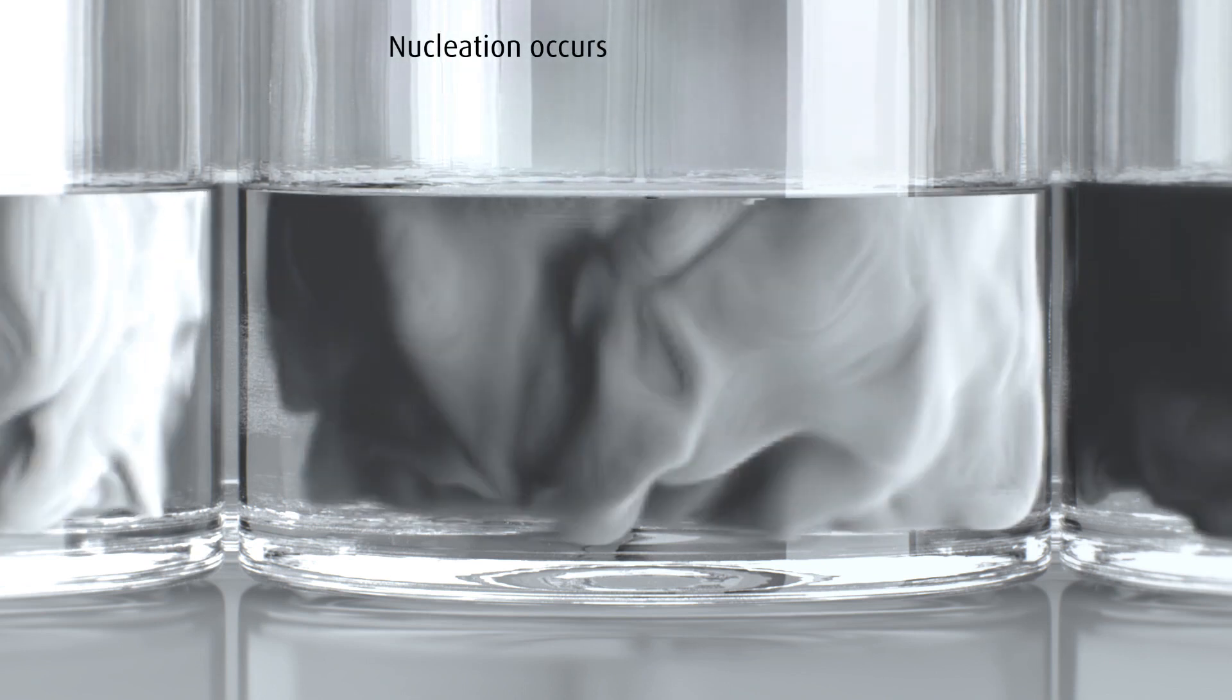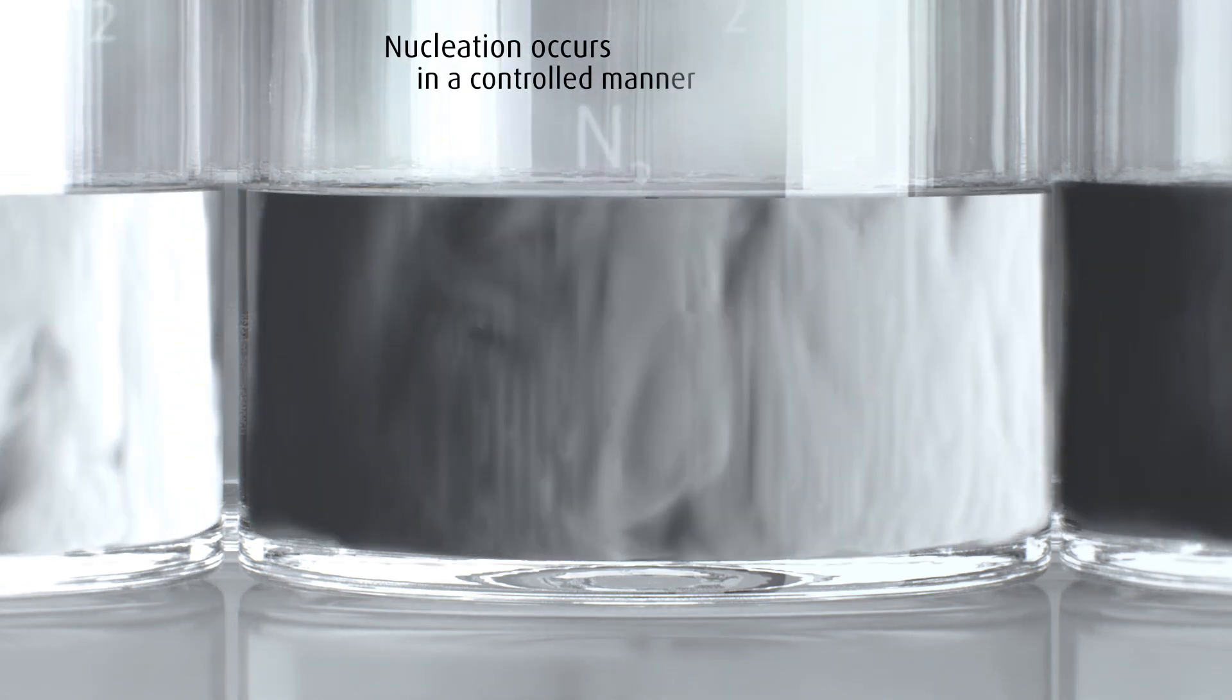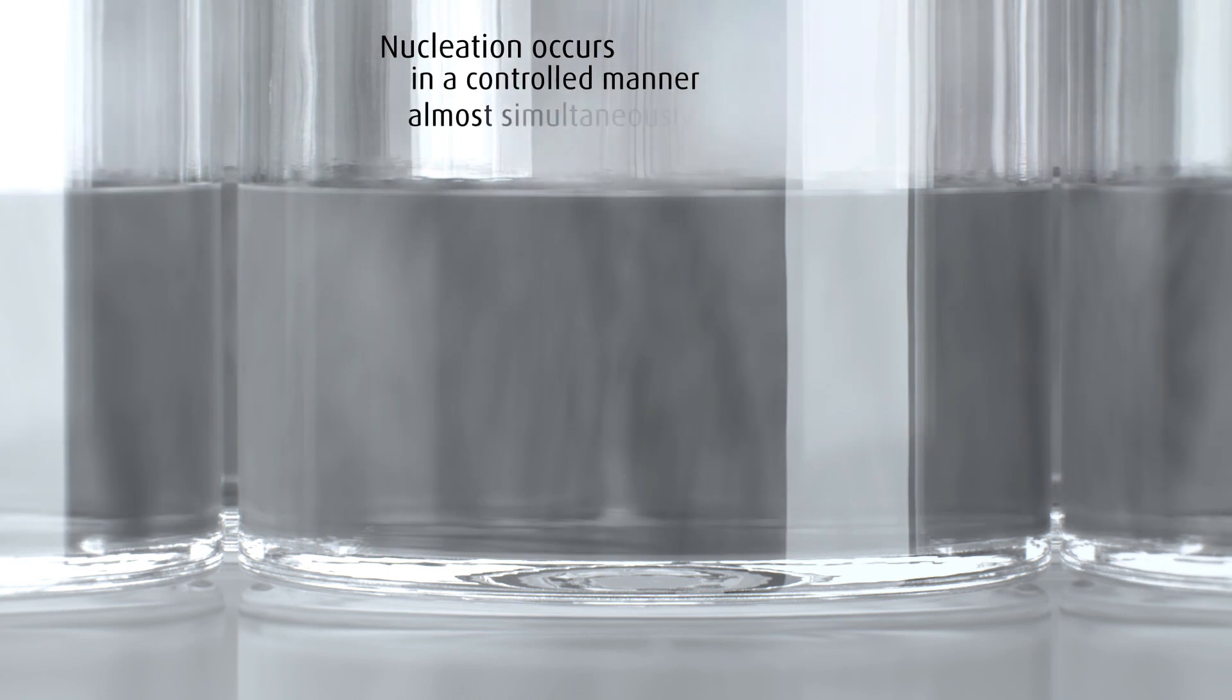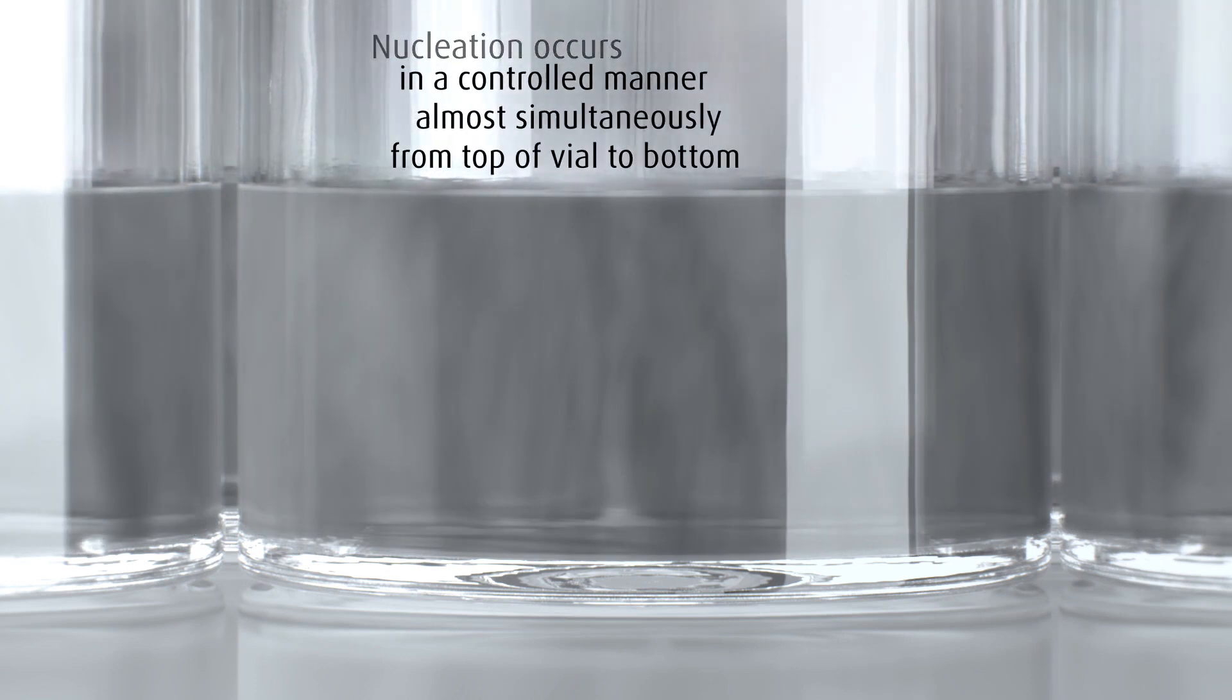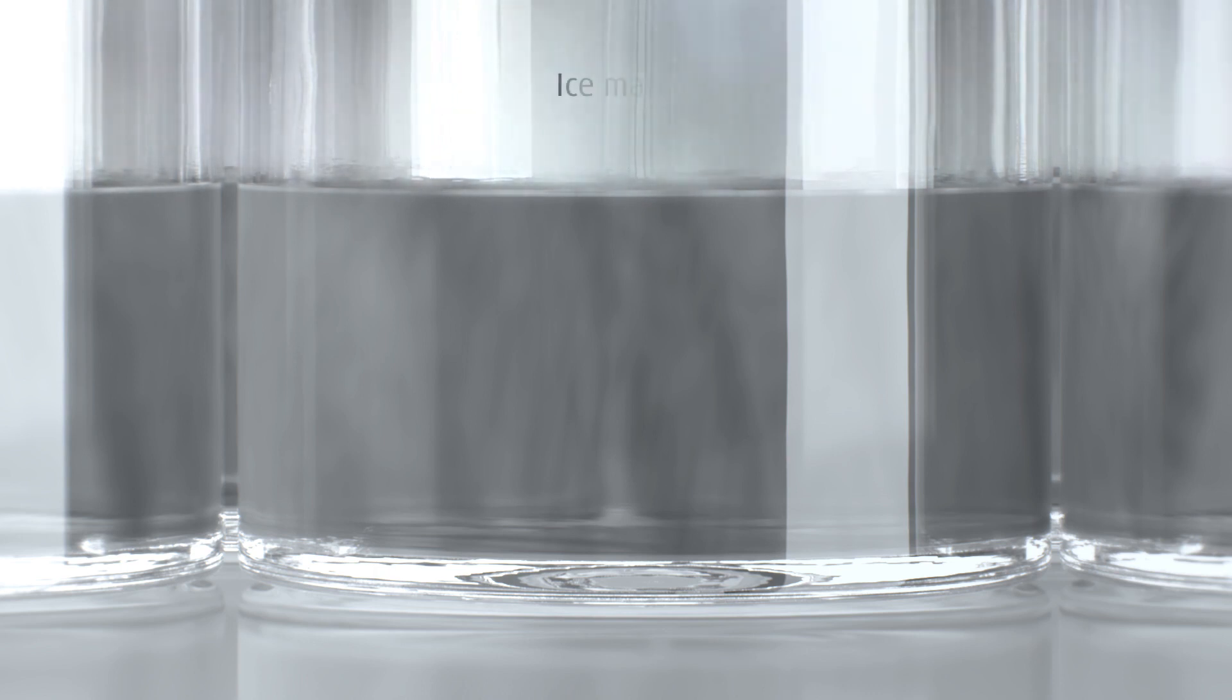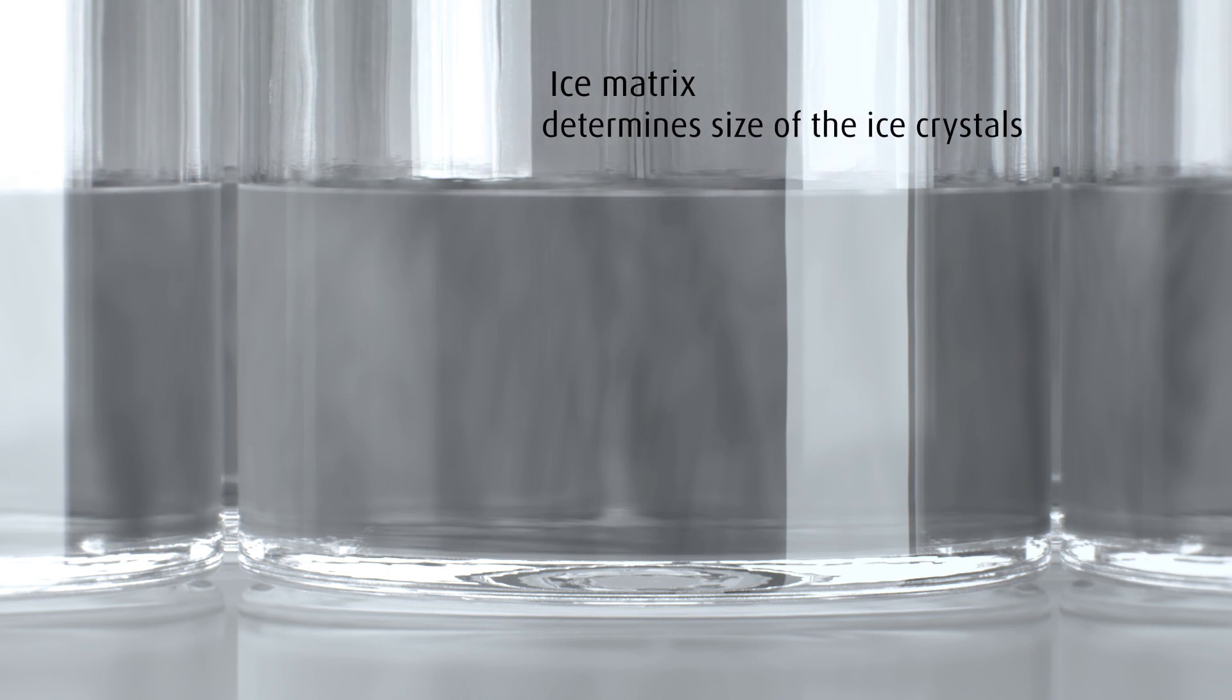Nucleation occurs in a controlled manner almost simultaneously across the vials and from the top of the vial to the bottom, forming the initial ice matrix which determines the size of ice crystals in the product.